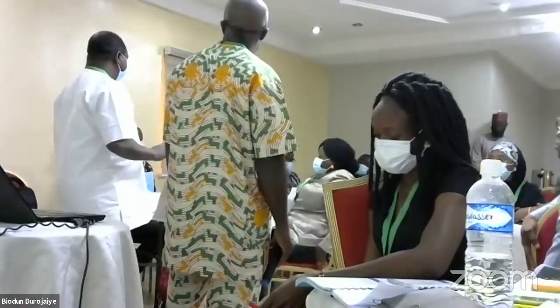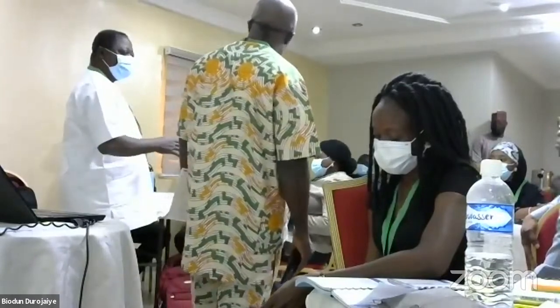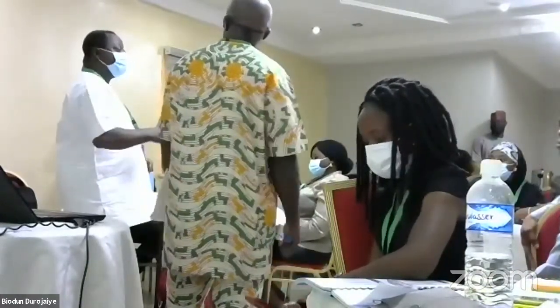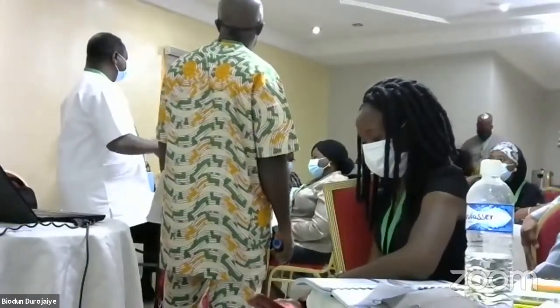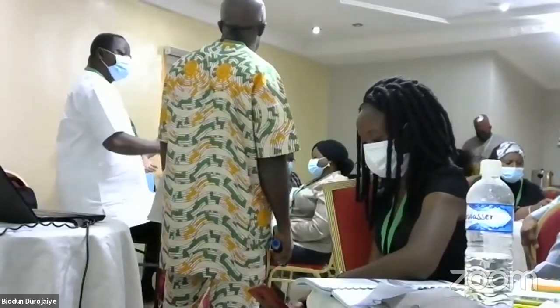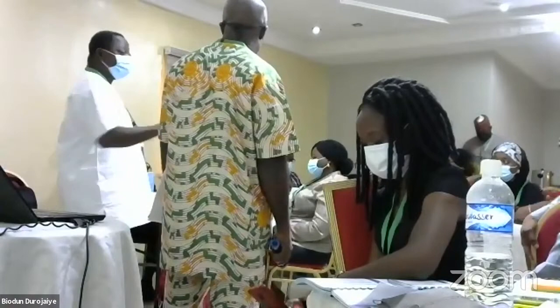Are you with me? And then you follow either regressive staining or progressive staining. In the case of regressive staining, you will first have to overstain, and then you begin to wash back. You understand? Whereas in progressive staining, you continue to stain and get deeper concentration of the stain. Now, that is what is expected in routine histological procedure.